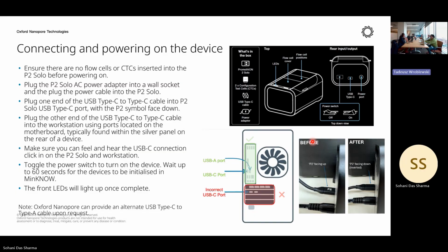MinION came first, and at that time the Nanopore engineering team made that flow cell that way, that's how it was built. But when the PromethION came, the engineering of the flow cell became completely different. It's only the structure of the MinION that is different from the PromethION, but the chemistry is the same. Everything is the same. Okay. Yeah, the software is the same.